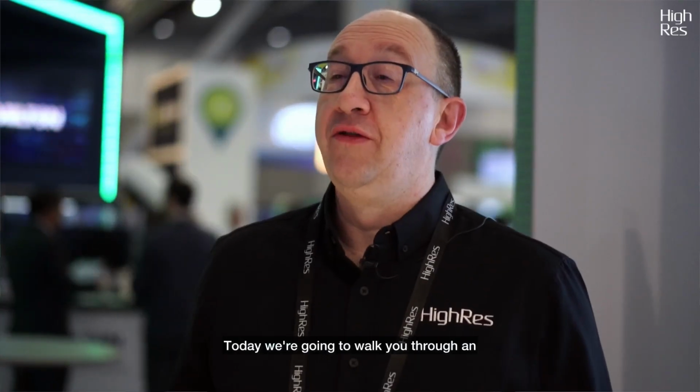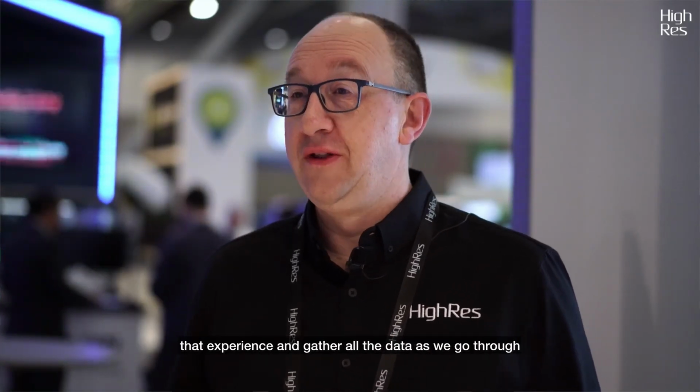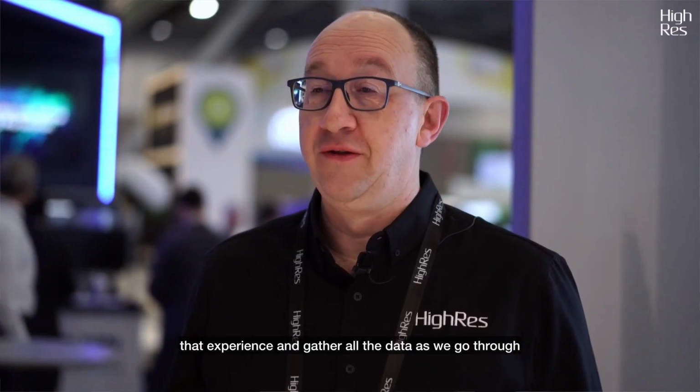Today we're going to walk you through an AI-assisted qPCR workflow that is only semi-automated, and we're going to use our software to guide you through that experience and gather all the data as we go through. But first, it's worth taking a step back and asking why HighRes is presenting this kind of workflow and not a fully integrated system.